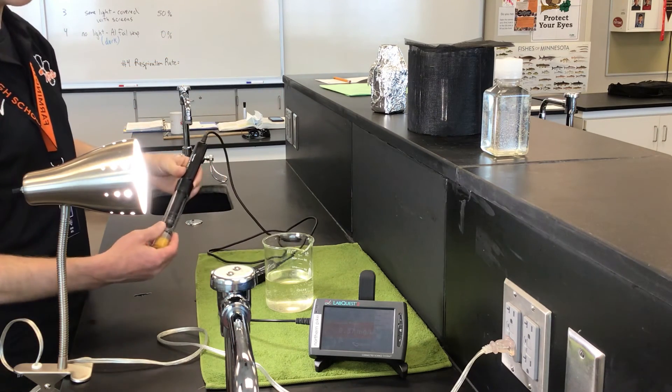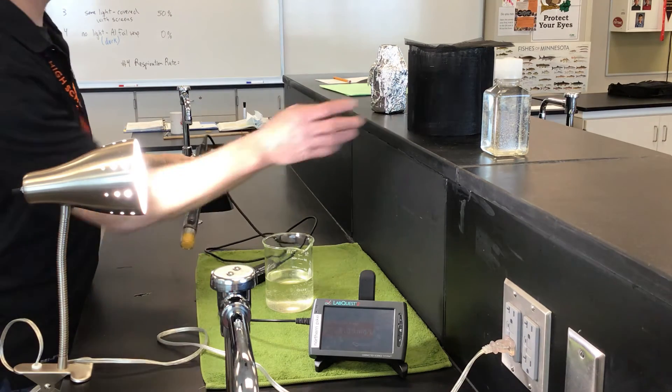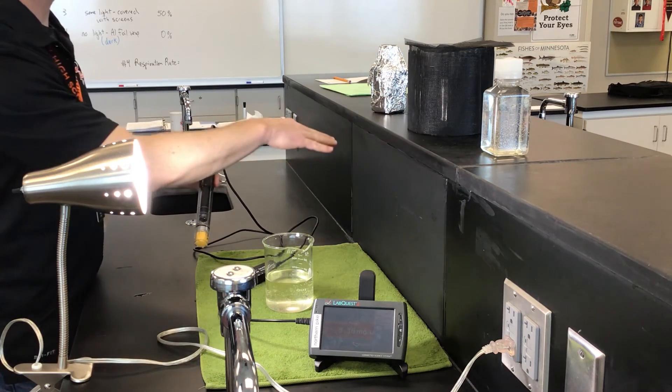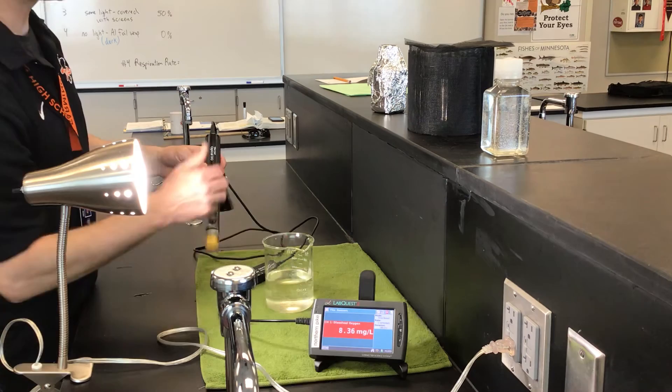readings on those. I'm not going to show that—I've already got readings from another class period that I'll use. But again, I just put the dissolved oxygen sensor in each of these, waited a minute or so until the number stabilized, and then I would write that number down.